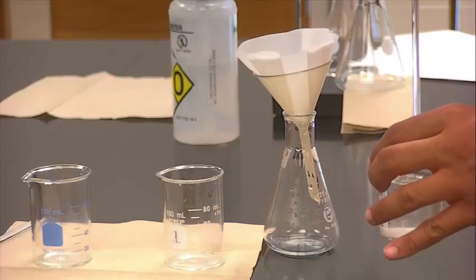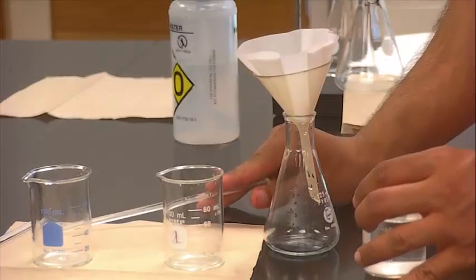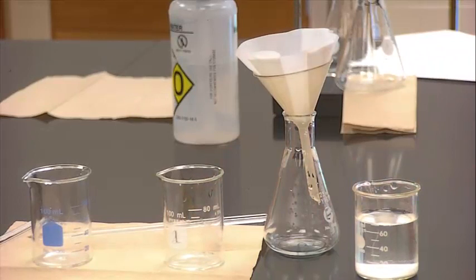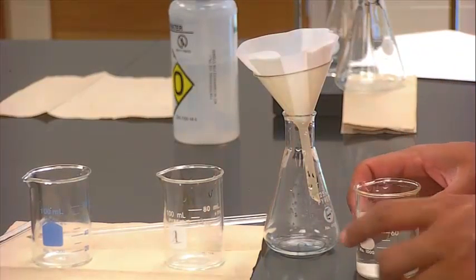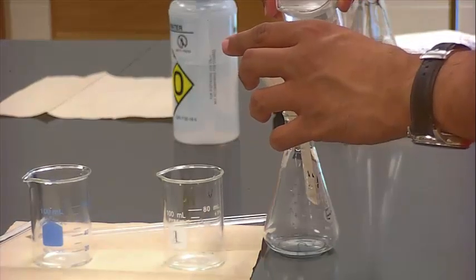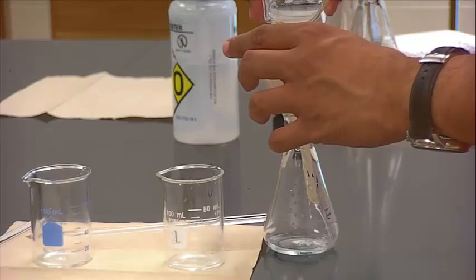So here's our precipitate. We've let it sit out for a while. Once you have the precipitate and it's settled like this, it may take maybe 10 or 15 minutes, go ahead and start the filtering process. So we'll just filter by gravity filtration. Get all that water out of there first.